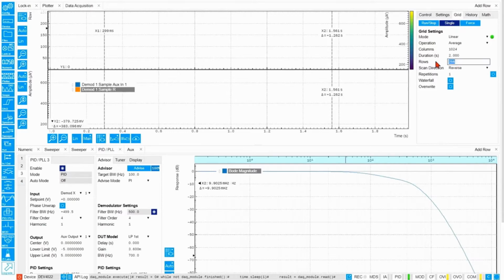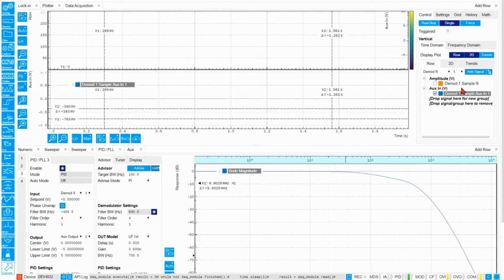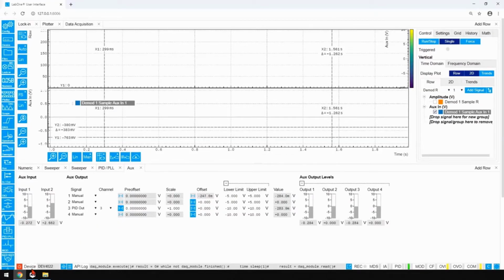So we have defined a grid of 256 by 256. So that will be the size of our image in the Nanosurf controller, but we can of course as well oversample here because we have enough demodulator stream. And here we also trigger from end of line so that we can record all the channels that we want. It could be much more than that, but let's focus on the CPD for today. So now that this is armed, we will also send the actual analog output of the PID to the BNC of aux output 3, and this will be imaged then into the Nanosurf controller.